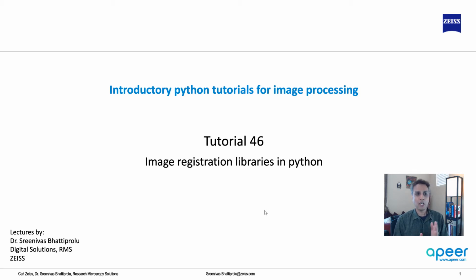In this tutorial, I'm going to talk about image registration libraries in Python. And there are many of them, so I'm going to just talk about a couple, but then go ahead and Google search if you think these 2 or 3 that I'm going to talk about are not going to be sufficient for you. But I hope you'll find these to be useful for your job.